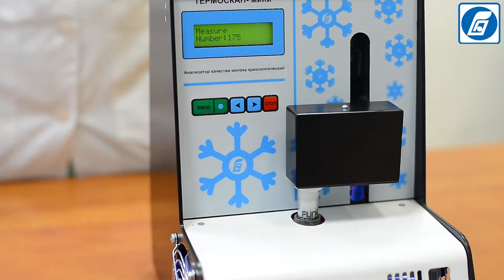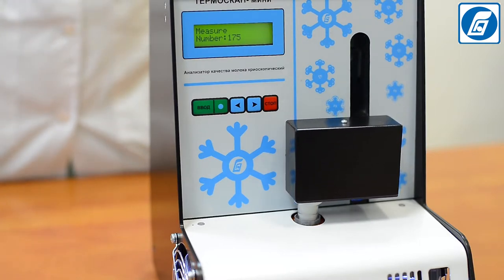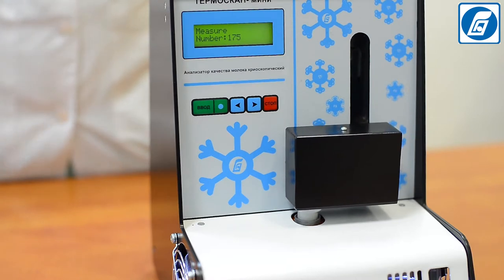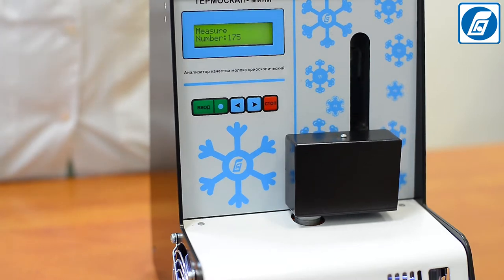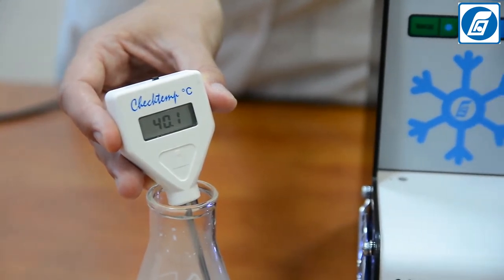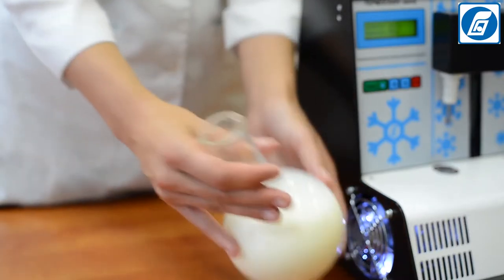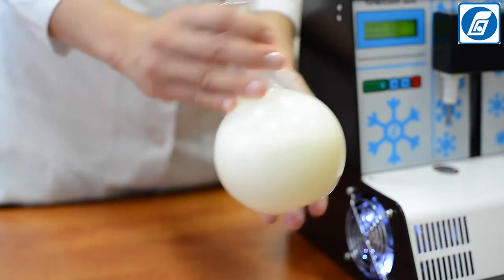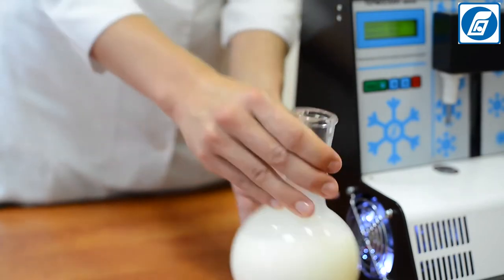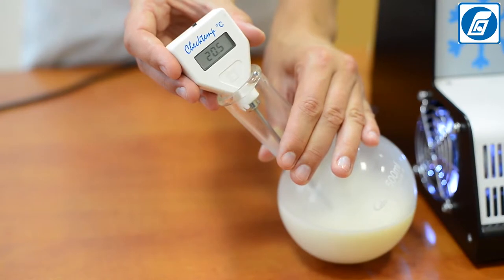If crystallization of the milk sample begins before the established temperature is reached, the cause is likely the presence of crystallized fat in the sample, formed during cooling of milk. In this case, preheat the milk sample in a water bath to 45 degrees, keep it at that temperature for 5 minutes to let the crystallized fat melt, then cool it down to 20 ± 2 degrees, and immediately perform the measurement.